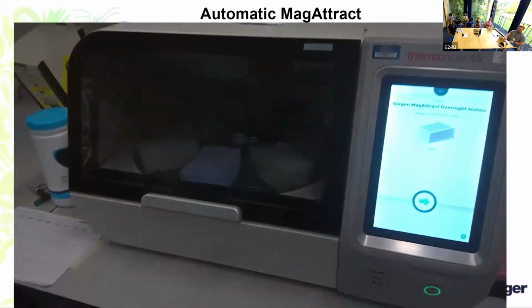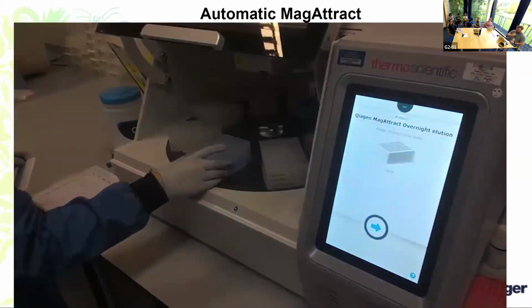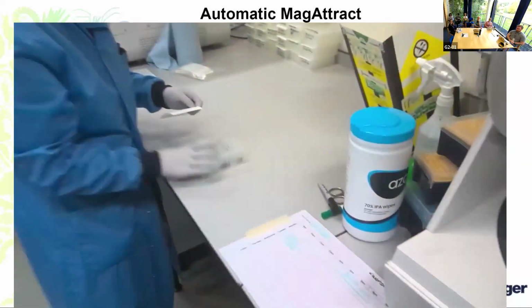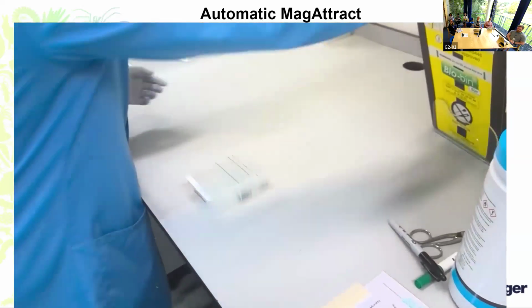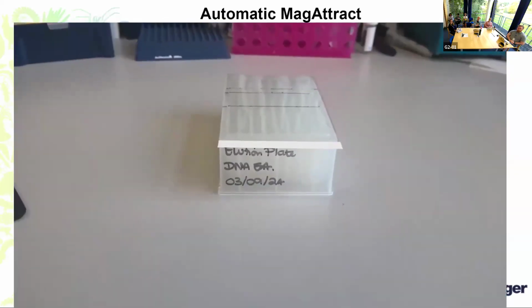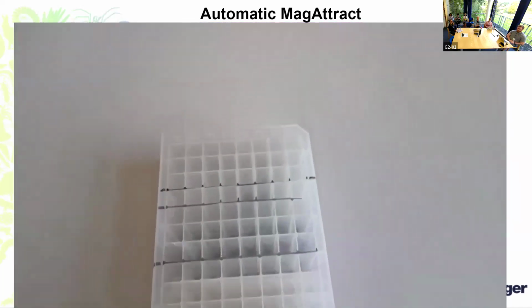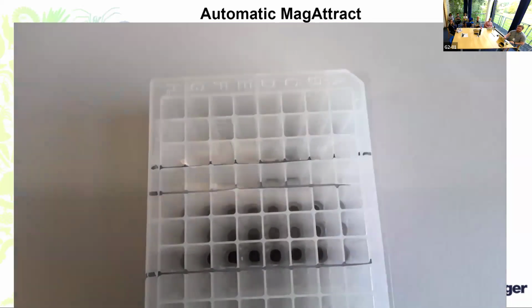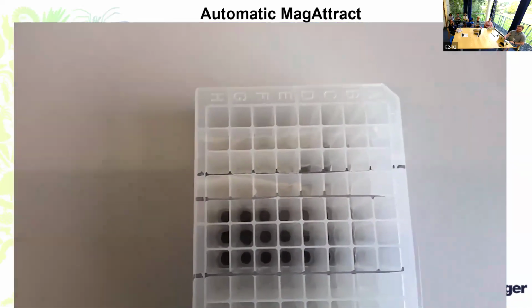So once the Kingfisher is finished running, we remove the elution plate from the instrument, which has all our hopefully high molecular weight DNA. So at this point, we cover the elution plate and leave it on the bench to elute overnight. So we still have the magnetic beads in the plate. The DNA is eluting overnight, and then the following morning, we'll remove the magnetic beads from the plate, and then we'll have our DNA, which we will then QC.